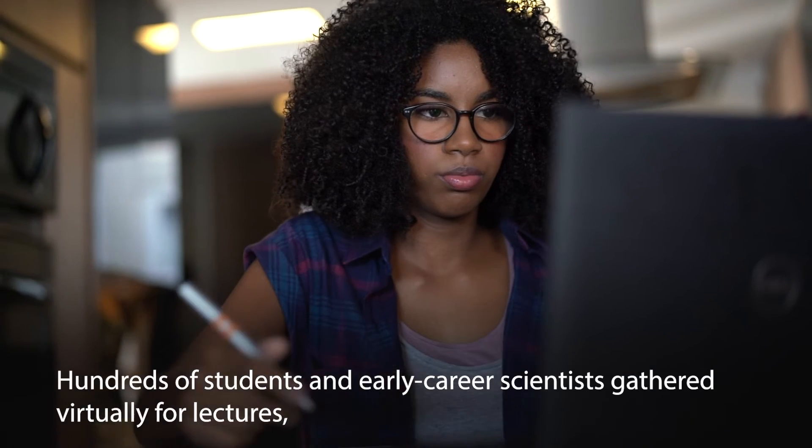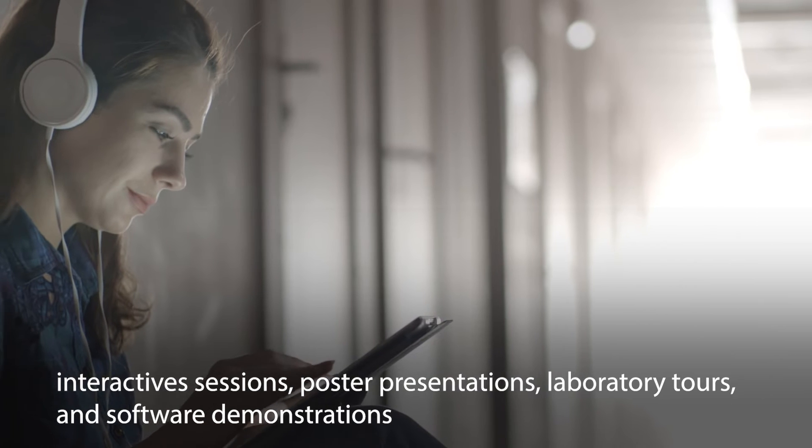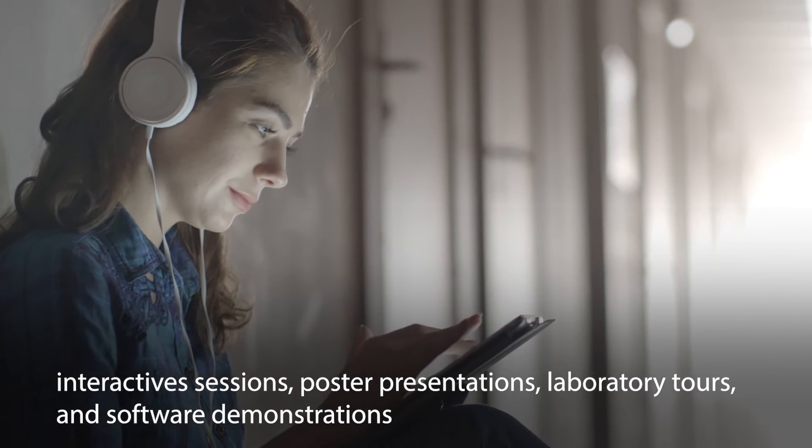Hey everybody, welcome to our second day of lab tours. Our first tour will be of our CAT lab. We will focus on the basic techniques and methodologies for conducting work in the laboratory.